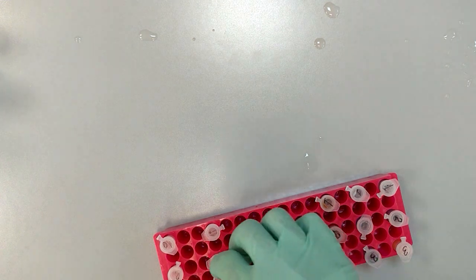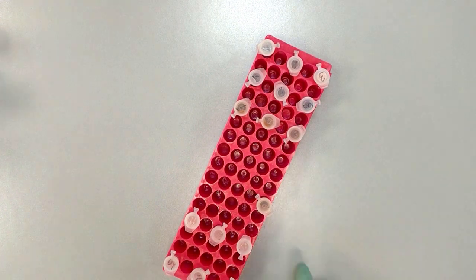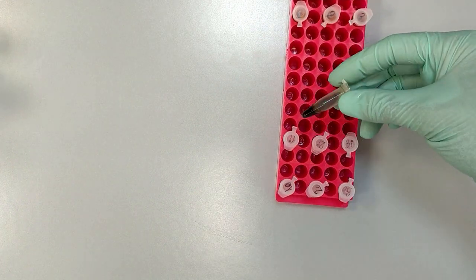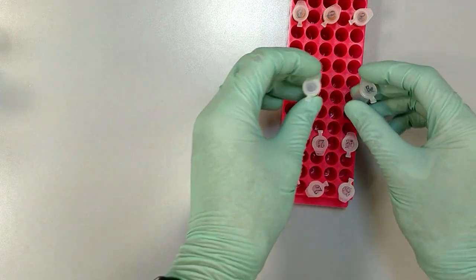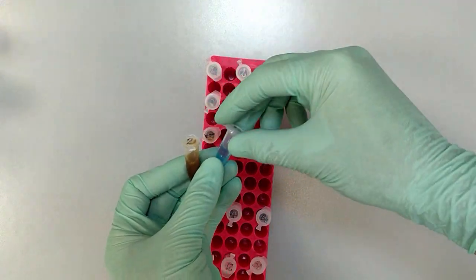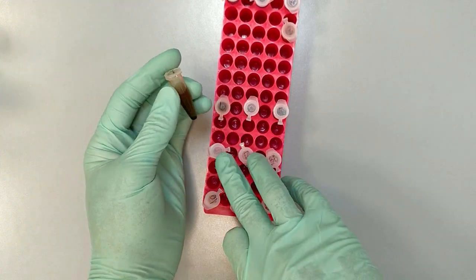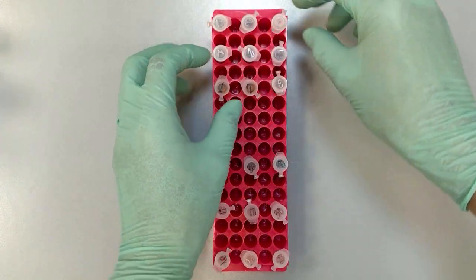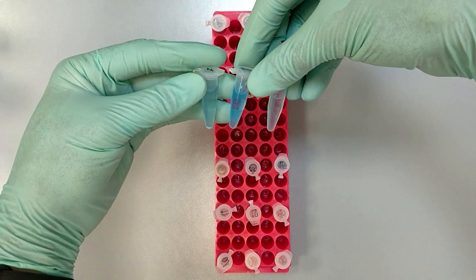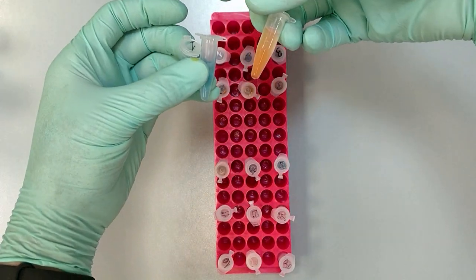Because we know which solution was reacting with which of the tests, we are going to directly add the iodine, for example, to the first I and first O. The same goes for Benedict's and Bradford's solutions. So again, the first secret solution was reacting with iodine. The second solution was reacting with Bradford. And the third one was reacting with the Benedict solution.